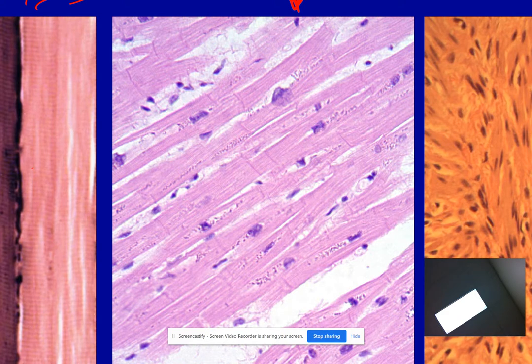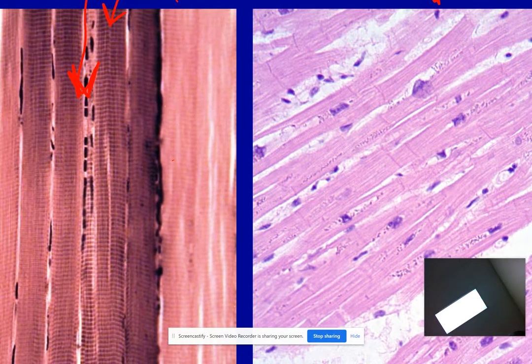That is one of the landmarks of cardiac muscle. As well, notice that the nuclei are big and round and kind of in the middle of everybody's business, right? They're not put out to the side like dashes like you see in the skeletal muscle.